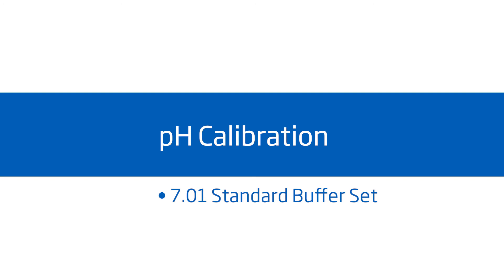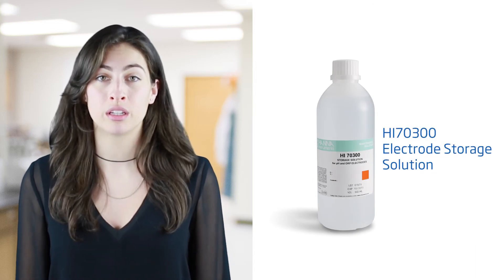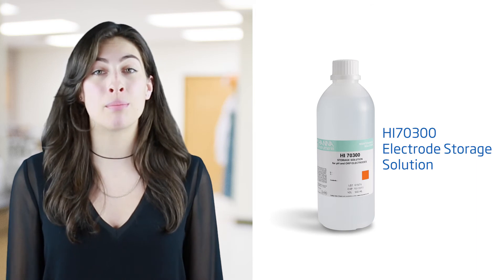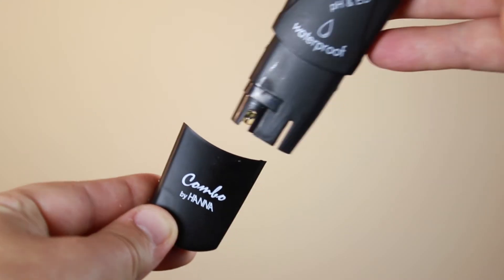Calibration is an important part of keeping your tester operating at its best. We recommend calibrating before each use. When you're not using your tester, we recommend you keep it in the HANA HI70300 storage solution. If you don't have storage solution, pH 4 buffer works too. Without proper storage, the electrode gets dehydrated. We recommend you clean and store your electrode after every use.